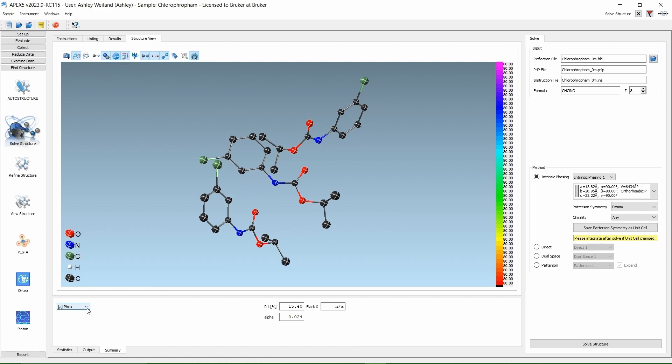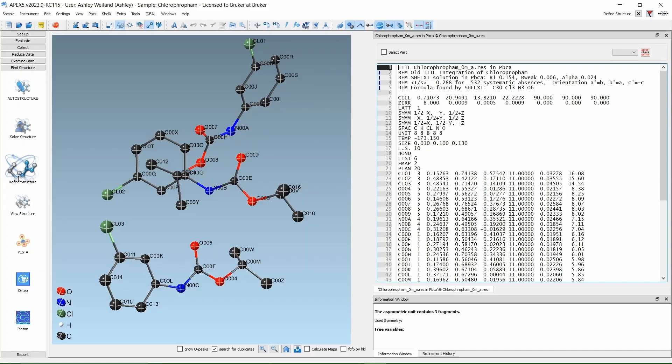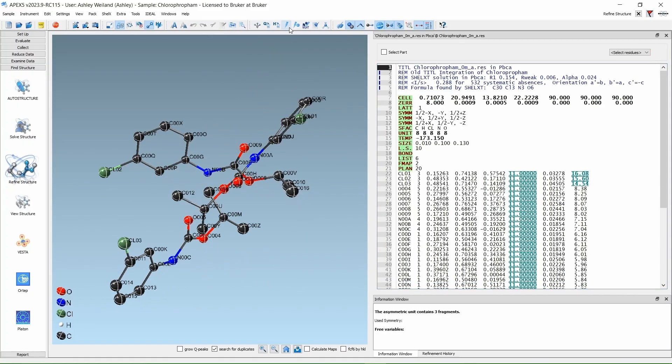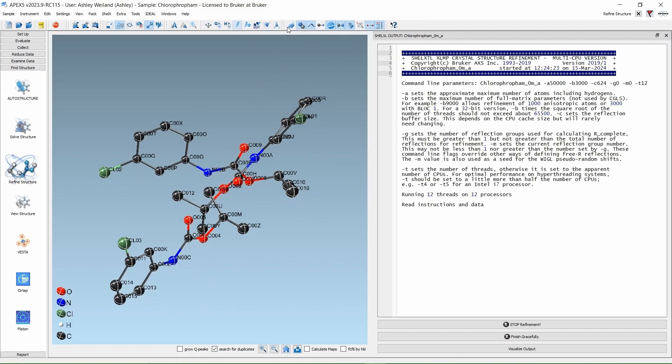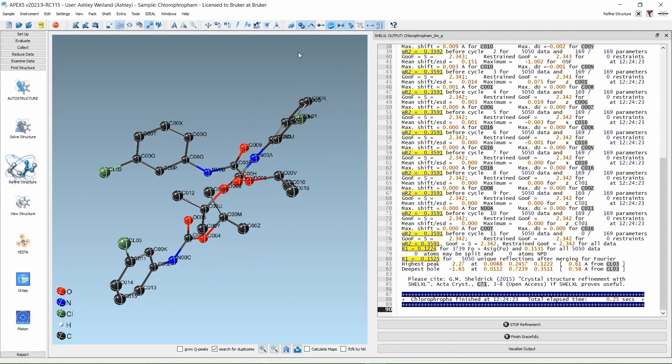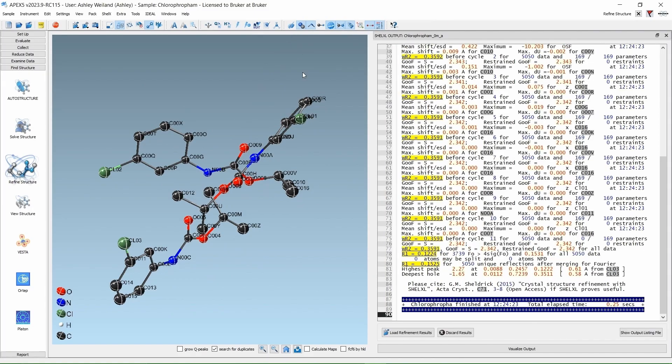Let's run a quick refinement cycle on our model. And you can do that by clicking the Lightning Bolt. Right now, we have an R1 of 12% and a WR2 of about 36%. Not bad for a starting model.